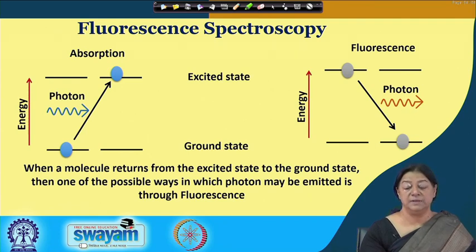This will happen when we have fluorescence. This will also happen when we have phosphorescence. So, once the light is absorbed, it will lose this energy. If it loses it in a fashion where there is emission, it could be fluorescence emission or phosphorescence emission, or it could be just a non-radiative loss of energy.